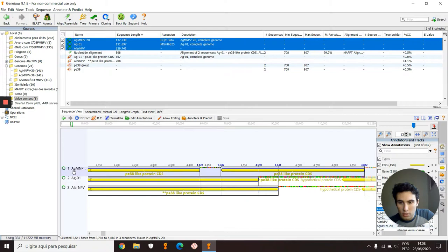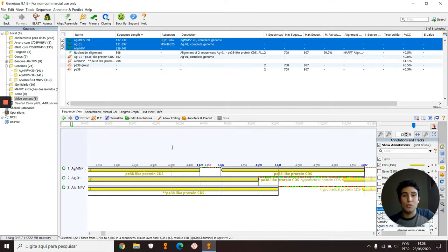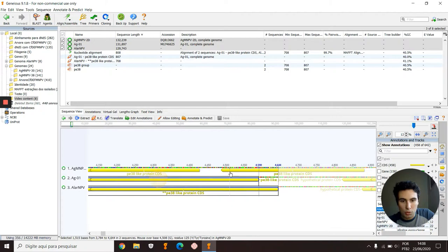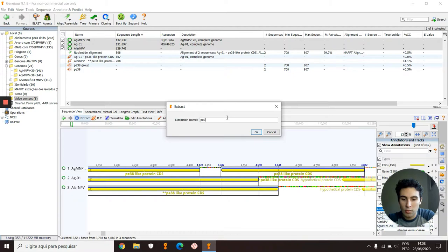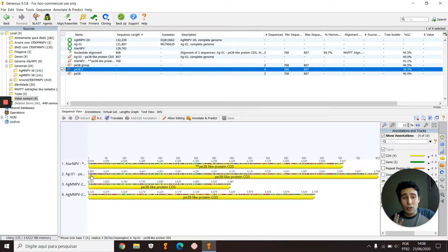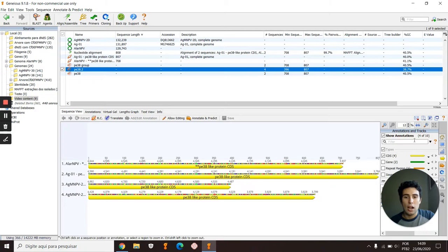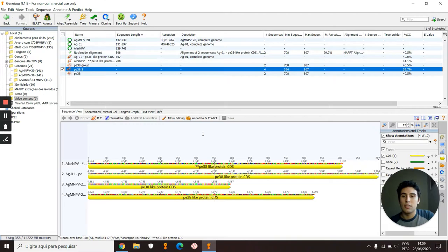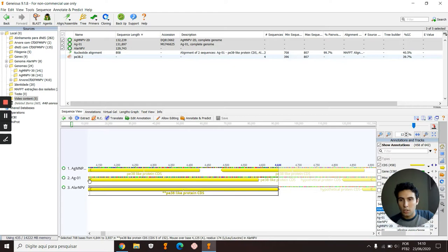I will realize that in this genome AgMNPV-2D, the gene pe38 is divided into two different ORFs. So if I just select them by Control and click on Extract, it will give me four different sequences as if they were four different organisms. So I don't want that. I want these two sequences just like this, and a third one with both ORFs aligned.